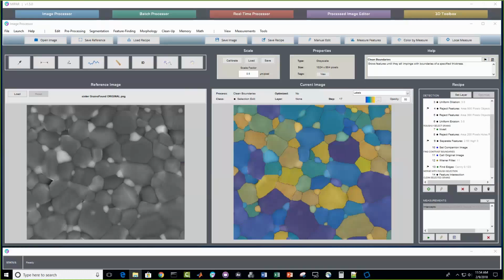Now, we've already shown how local thickness can be done. So I'm going to forego the core shell example that I had where it was measuring local layer thickness, since we demoed that capability in the matrix of those particles just a moment ago. So I'm going to conclude with a batch processing example.